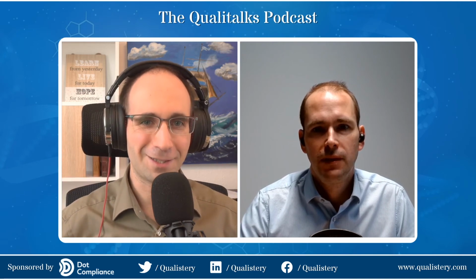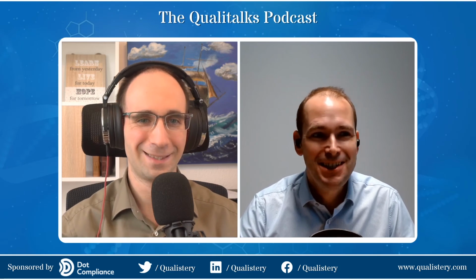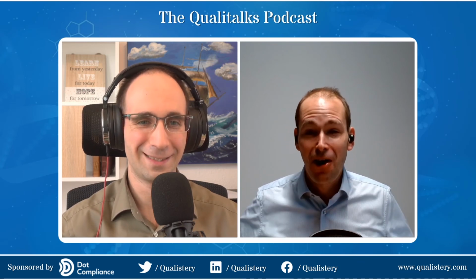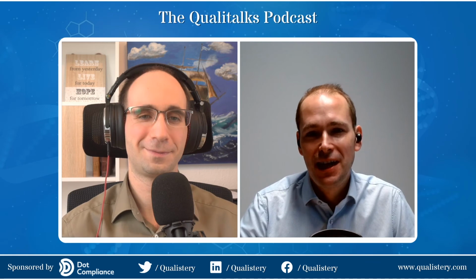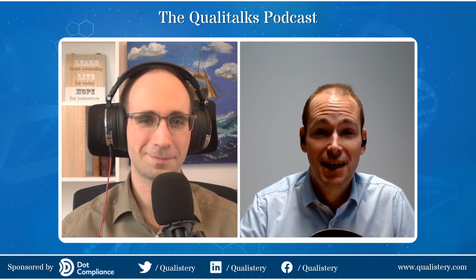You know, it should be, but it's not that simple. But it is, like you say, a really simple piece of equipment. All it is is a box with steam in it. But it causes a lot of problems. And anybody who runs autoclaves will know there are always issues. And it's about minimizing those issues and preventing any continuous downtime and ensuring the quality as well throughout. And I guess detecting any failures.